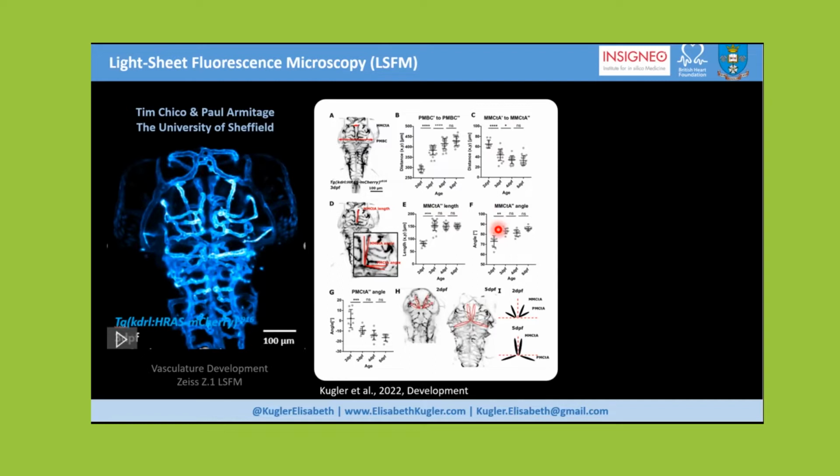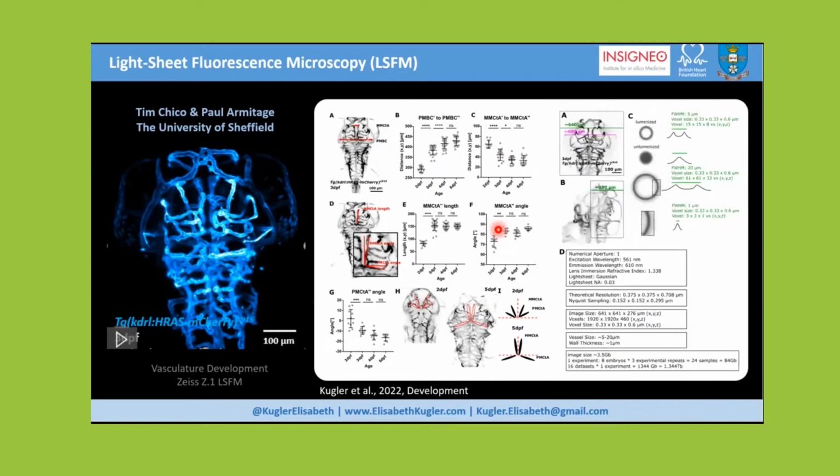But in addition to all of this telling us something about biological variability, this also told us a lot about how we do the imaging and how we can improve the imaging even further. I mean by this taking these measurements and improving the field of view, region of interest, as well as resolution. If we go back to this example from the width from the left brain to the right brain, we know that this is about 600 micrometer at this age, and so we would set the image width to about 640. So we would allow for some wiggle room, but we minimize the empty voxels within the images, and therefore we reduce the data load down the line for any data acquisition.